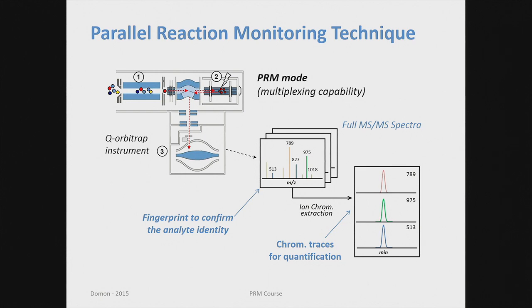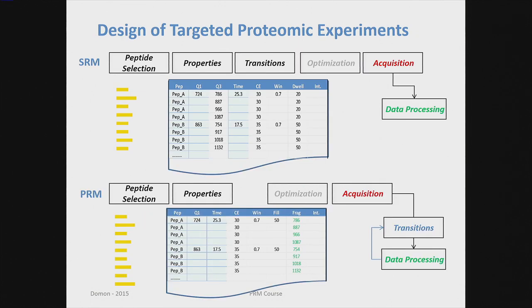So the instrument can, on the fly, make clever decisions on what is important and what is not important. And that will be the topic of the session after lunch. And again, the main difference between the two methods is in terms of experimental design.